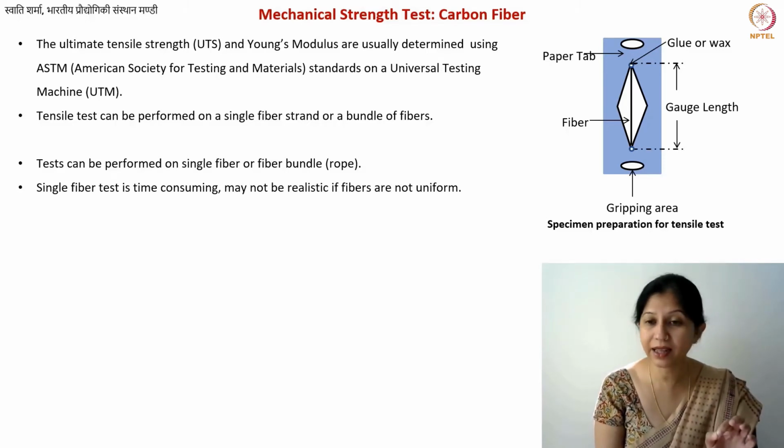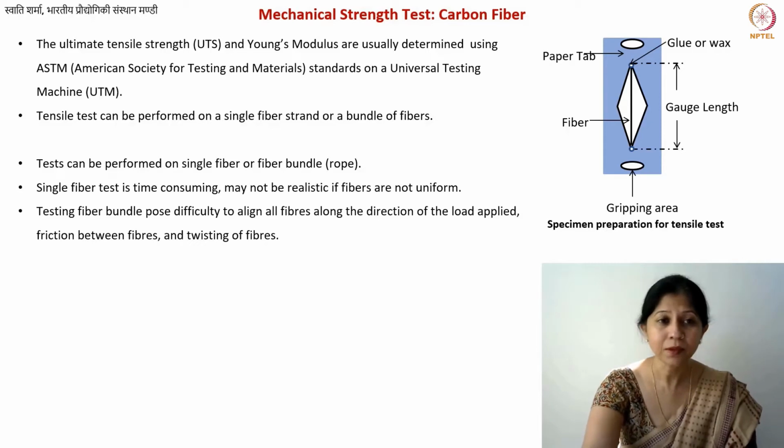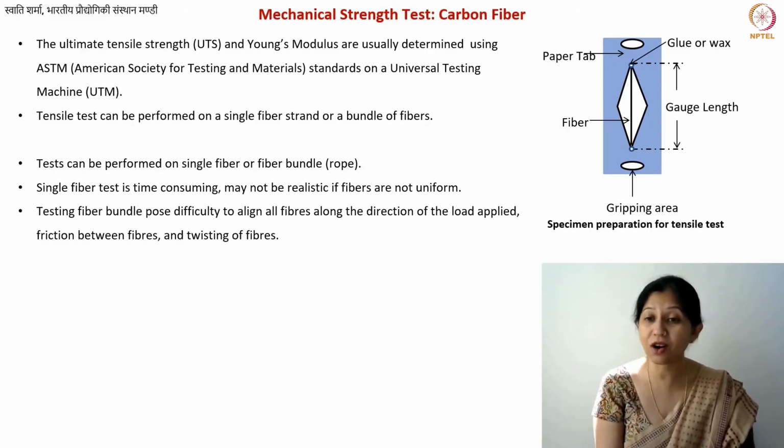Okay. Other than that, in general, if you want to utilize single fibers for a certain application, definitely you can perform the test on a single fiber. However, you need to know how realistic it is in terms of your application. Okay, now if you test the bundles of fibers, it is more realistic. This is how you're going to use them for your manufacturing applications. But there are also issues with that.